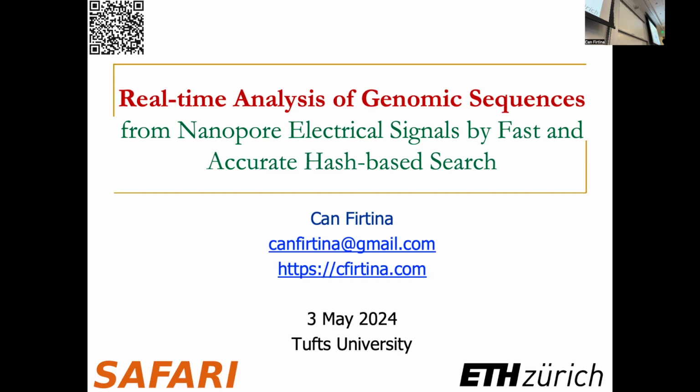I'm curious, are you working with Oxford Nanopore to put this on their devices, or can anyone who owns a device put your algorithm in there? Yeah, so we're not working with them actively currently, because they already have a platform where they enable base calling in real time. They don't really do raw signal analysis over there, but they provide the API for us to do it. And actually the API is almost integrated there. So soon in RawHash, you're going to be able to connect to the Nanopore device and run RawHash directly connected to the device using that API.